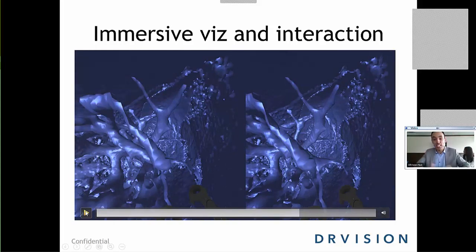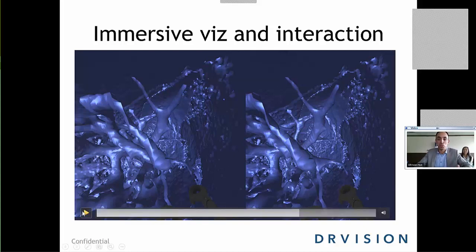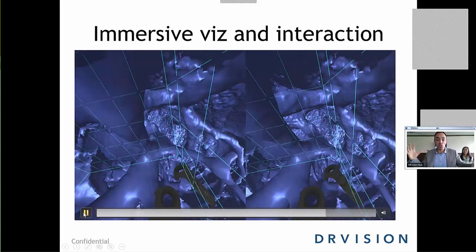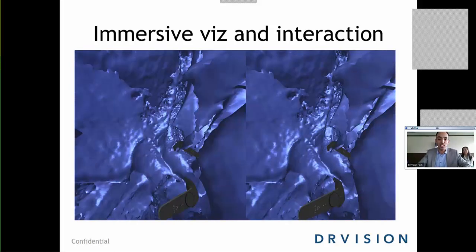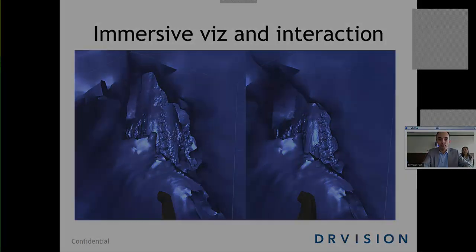This picture is inside the abdomen of the mouse embryo, and it looks like some of the structure within the lungs that we can see, and I'm exploring that in VR. I made the embryo so big that it's maybe 2 or 3 times bigger than the room, so I can actually walk inside each of these small spaces, which I've expanded, and explore them.